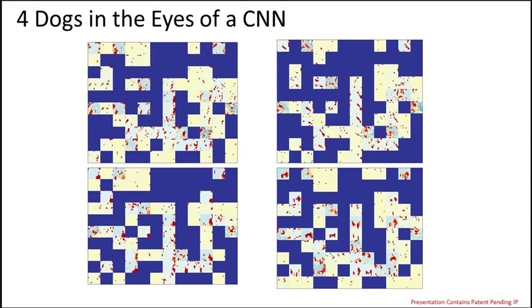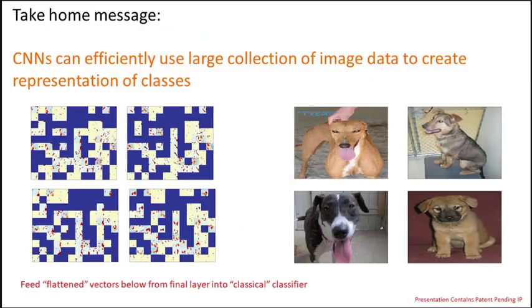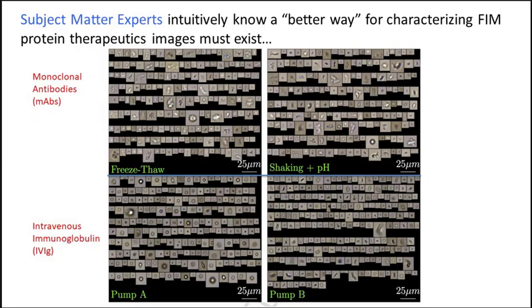It basically takes a high-dimensional feature vector and predicts class probabilities based on these inputs. And this is the real success story of modern convolutional neural networks. You have a large collection of labeled images, and it's able to very accurately distinguish between subtle things that a human can easily do, but a computer has had a hard time doing in the past. And it can do it with incredibly high accuracy.